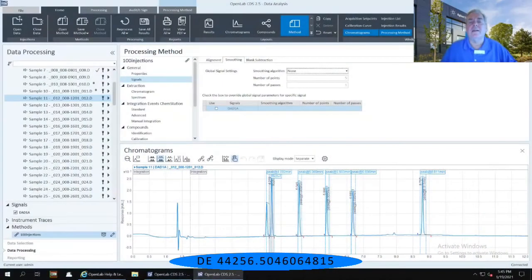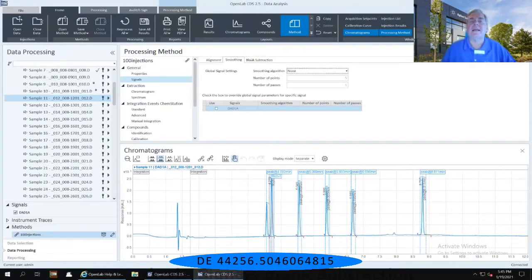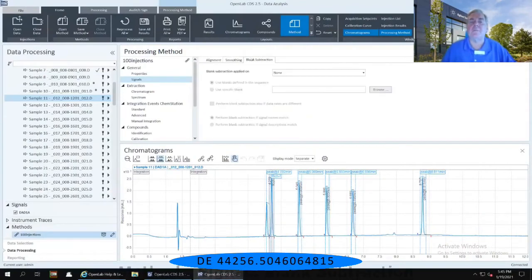And then finally, immediately to the right of the smoothing tab, there is a blank subtraction tab.